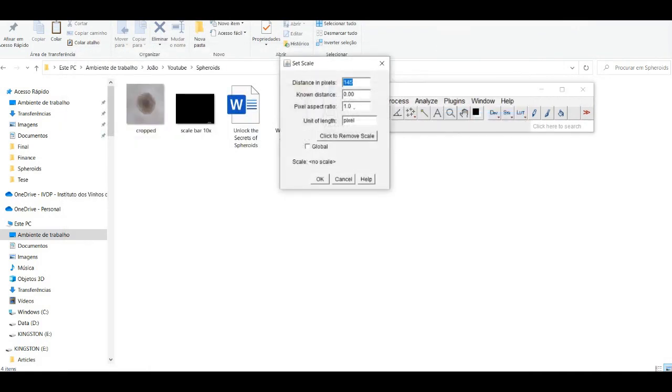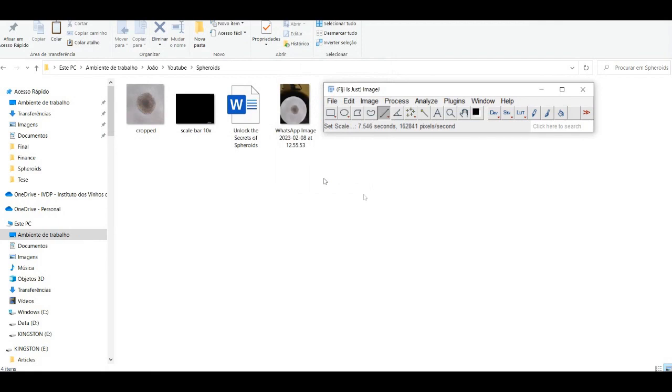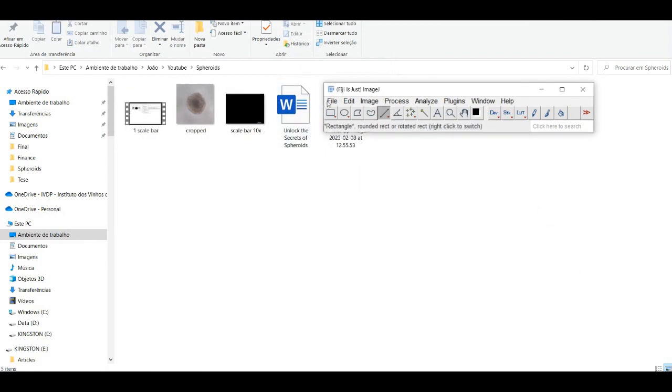Second, you need to set the scale using the scale bar, ideally from your spheroid photos. Then go to Analyze and then Set Scale and Global.